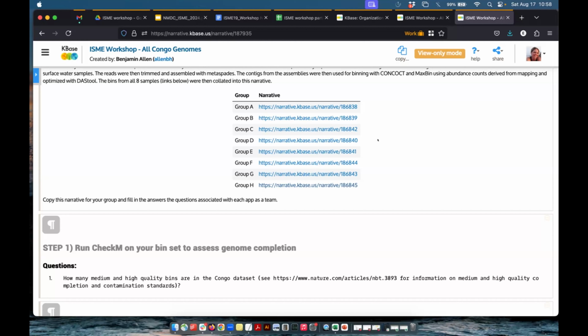That is the goal of the DRAM activity today. I wanted to walk through this narrative and specifically the DRAM outputs for in-person and online, so you can see where you should be looking for answers to these questions. There are about 15 questions, and for the folks online, these questions are not unique to this data set.